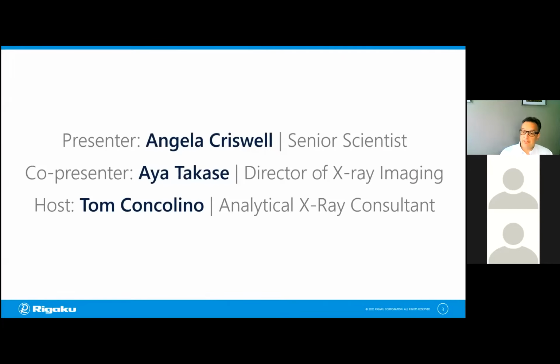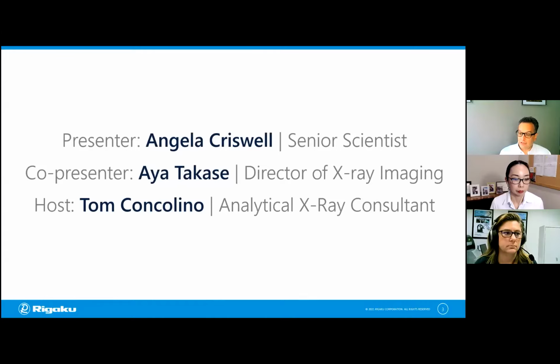I'm Tom Concolino, and I'm here with our presenters, Angela Criswell and Aya Takase. Thank you all for attending Rigaku's virtual workshop series on X-ray computed tomography. This is the second part of our session on micro-CT data collection techniques.